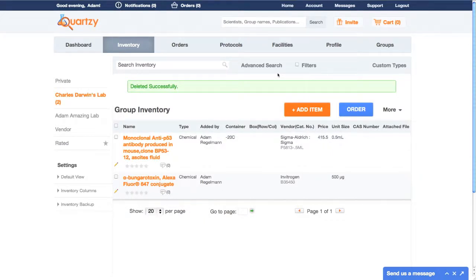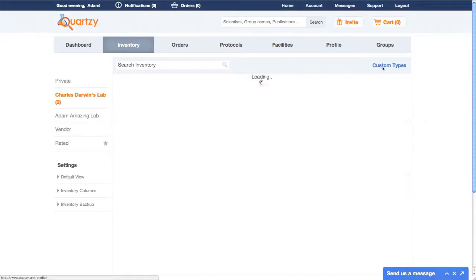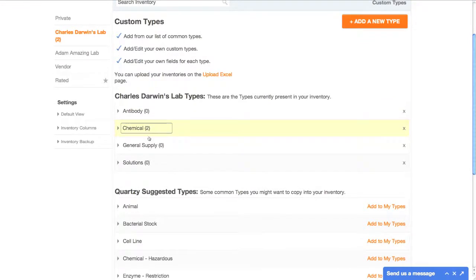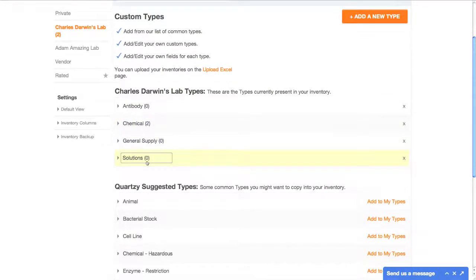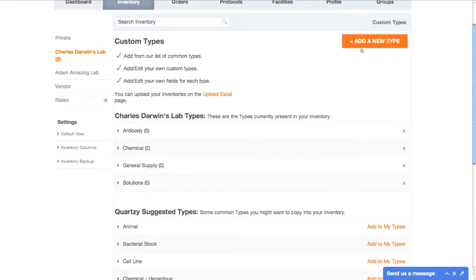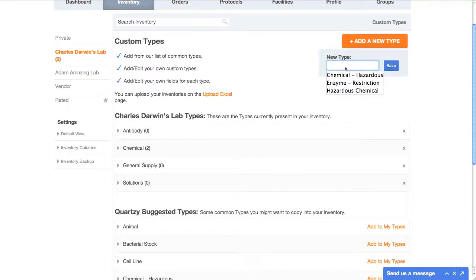What about the types or categories for inventory items? Can I customize those? Yes, I can. Just click the custom types link at the top of the page. When you first join, you'll have three types already in your inventory: chemical, general supply, and solutions. If you need more, you can either add one of Quartsy's suggested types like antibody, bacterial stock, chemical, etc., or you can add your own by clicking the giant orange Add New Type button at the top of the screen.